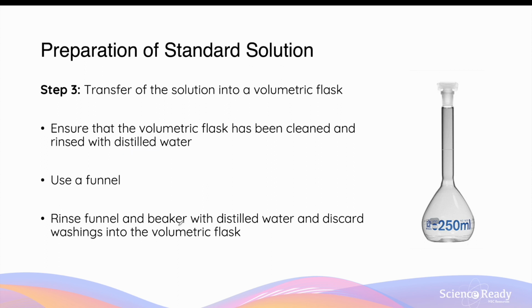After the transfer of the solution from the beaker, make sure you also rinse the funnel and the beaker with distilled water as well, and discard the rinsing into the volumetric flask. This is to ensure that we are achieving a complete transfer of the sodium carbonate from the beaker into the volumetric flask. If we leave some sodium carbonate behind in the funnel or the beaker, then the concentration of the sodium carbonate will be slightly lower than what we want it to be.